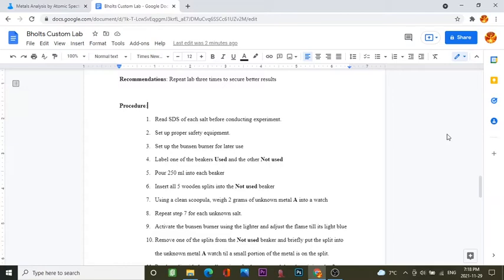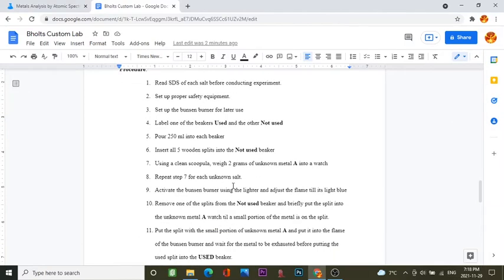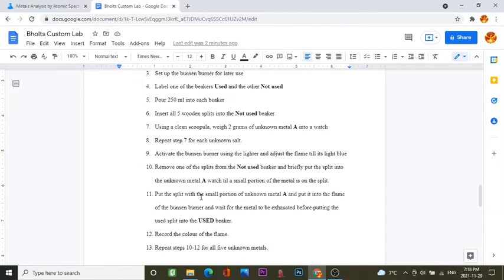Repeat step 7 for each of the unknown salts. That's why I recommended 5 scoopulas, as you don't want to clean off a scoopula 5 times. That gets repetitive. Unless you only have one, then you have no choice. So step 8, repeat steps. My bad.